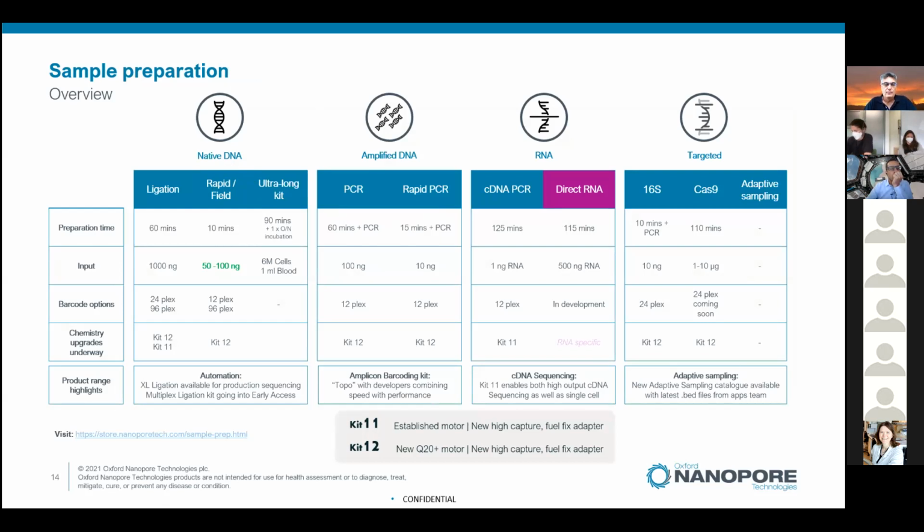One of the key aspects of this version is that the amount of DNA required drops from about 400 nanograms for the old kit down to 50 to 100 nanograms. This is going to be really useful where there's limited sample availability, and I'm thinking possibly environmental samples or culture samples where there's not a lot of DNA that you can get out of poorly growing strains.